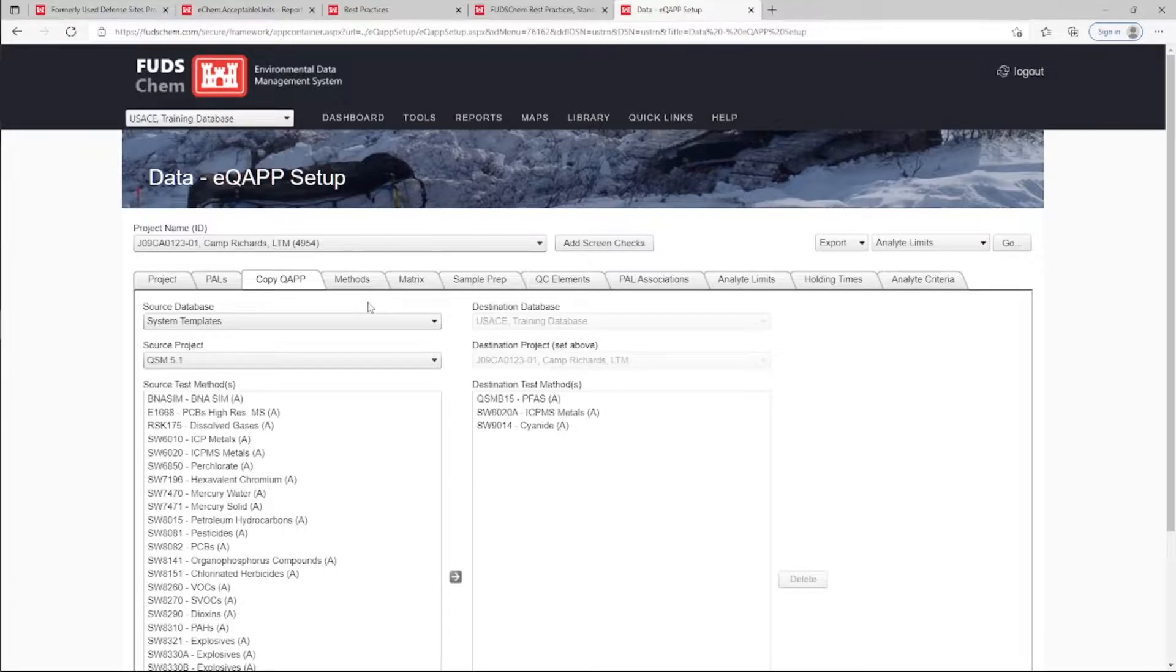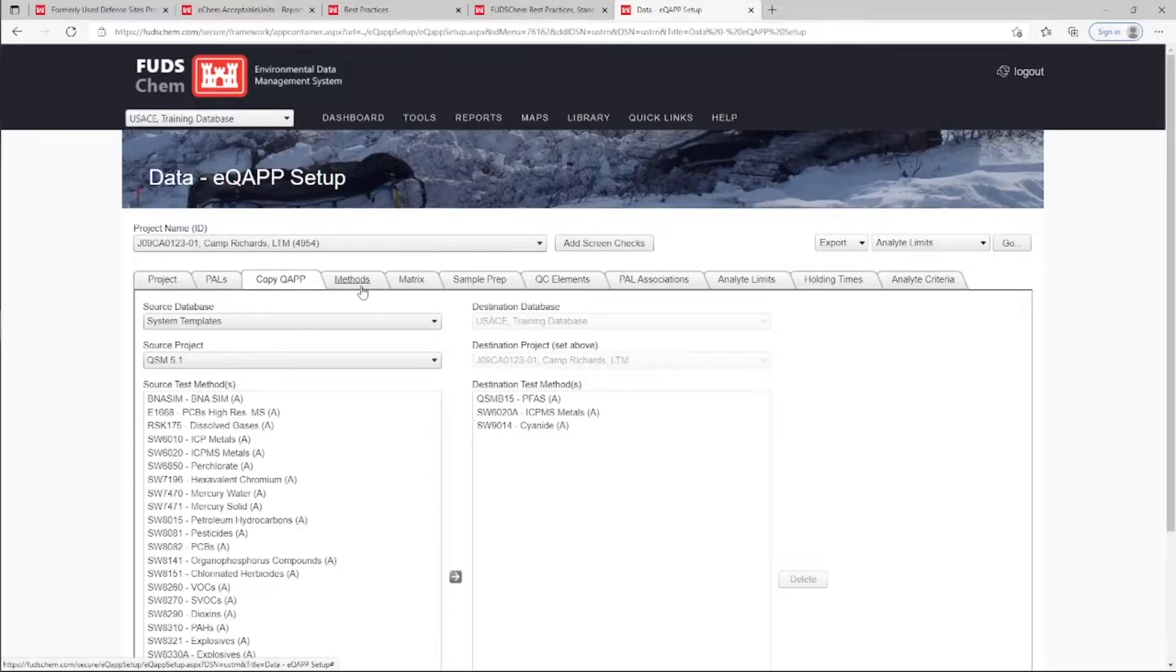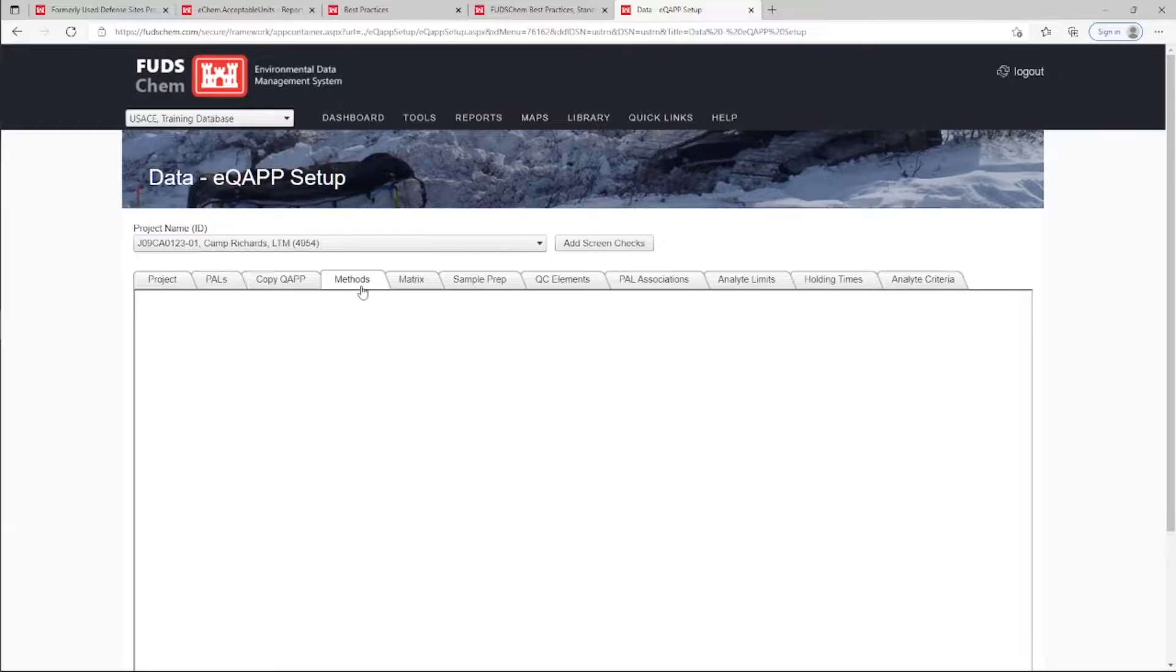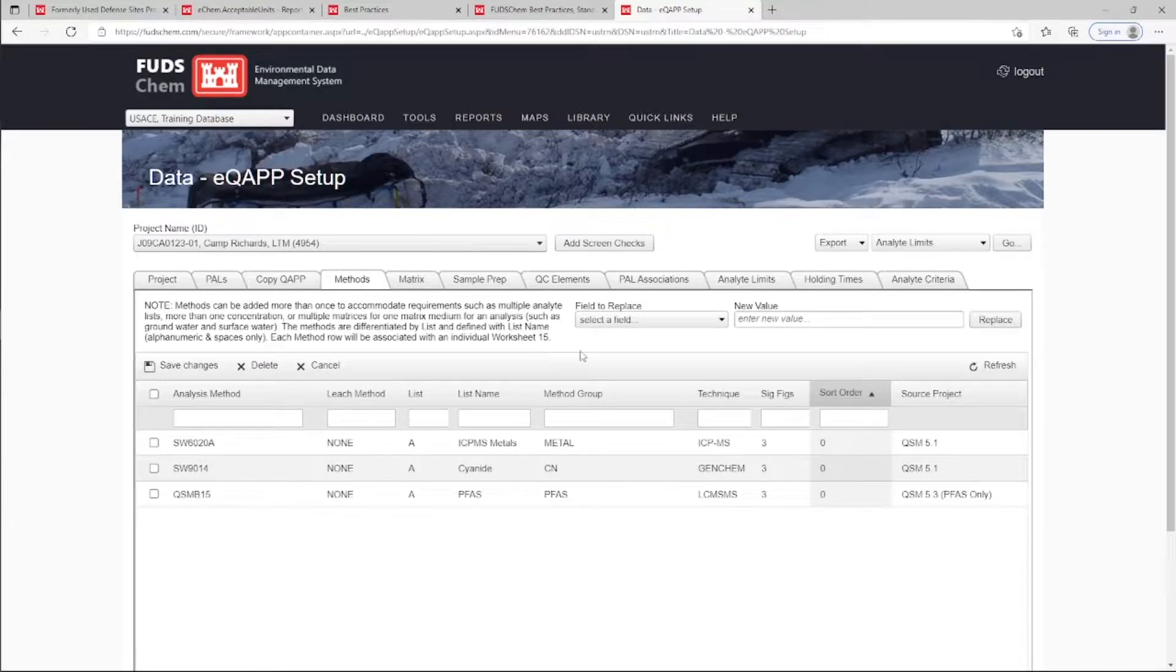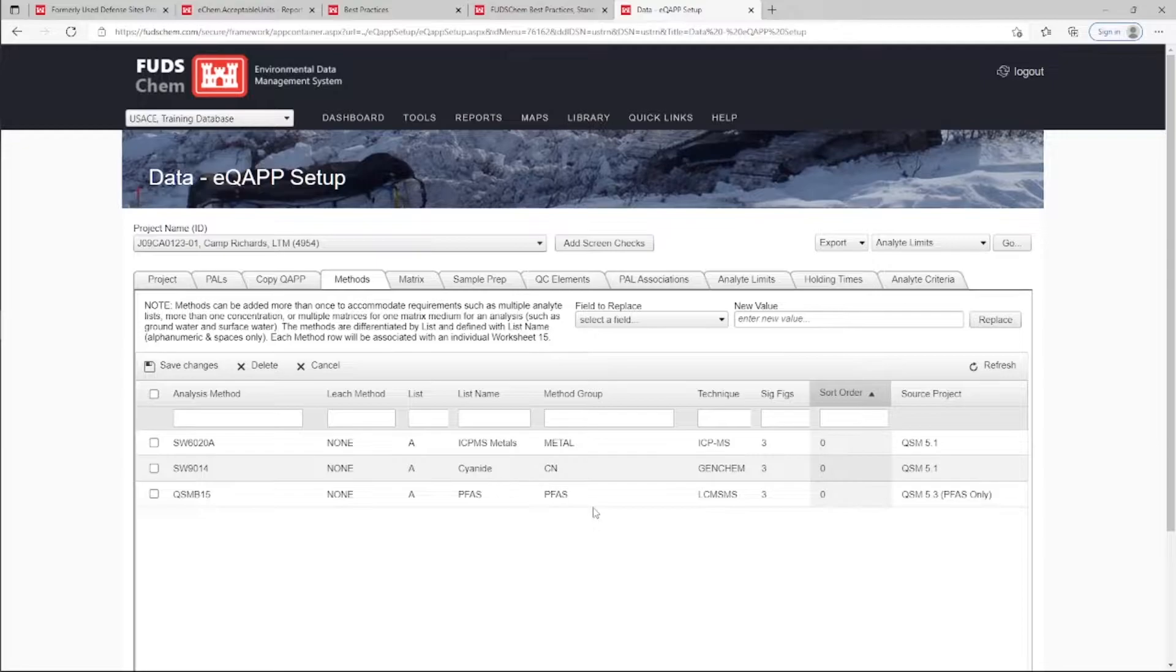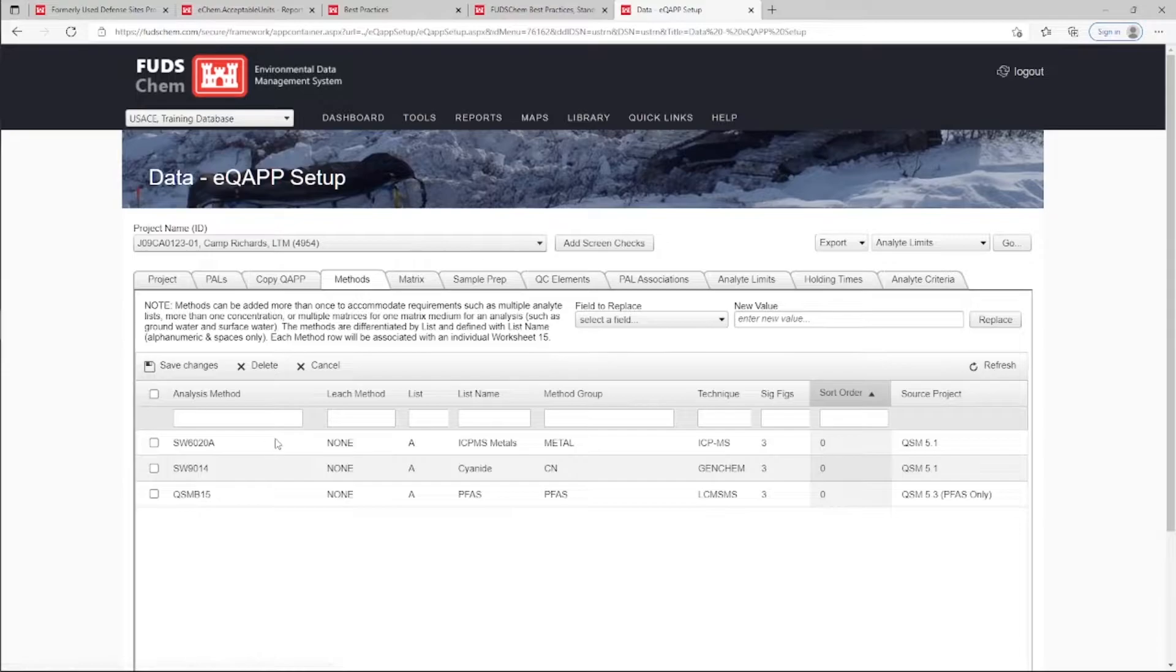The method group code for methods added to your project can be seen in the EQUAP Setup tool under the Methods tab. The method group code is pre-populated according to the original method selected in the CopyQUAP tab, and should not be changed unless the method code is changed.